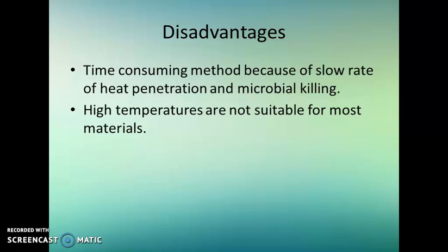After maintaining the temperature for the 1 hour holding period, we switch off, and again we wait a couple of hours, I think 1 more hour, and only then do we open it.